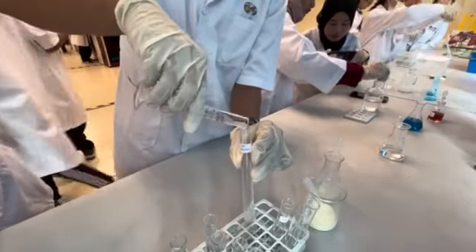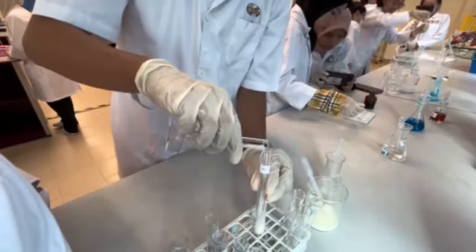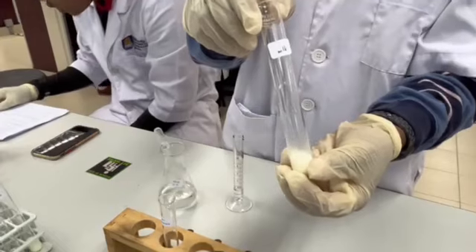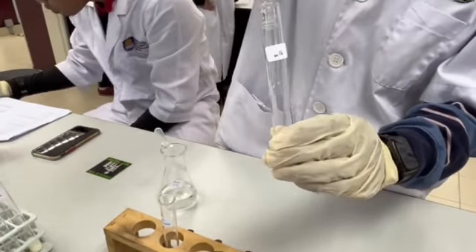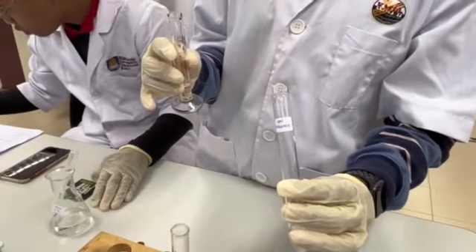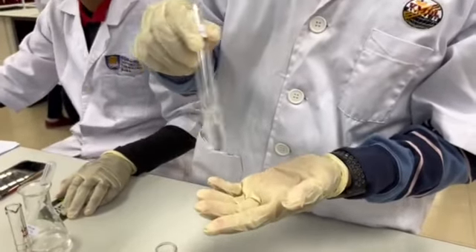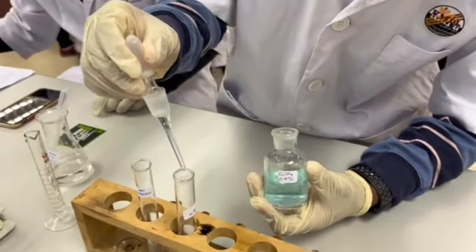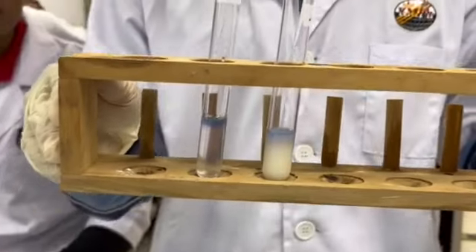Place 3 ml albumin solution 5% and milk into 2 different test tubes. Add 3 ml sodium hydroxide 2% and mix gently. Add 4 drops of cupric sulfate 0.5%, observe the color changes, and record the result.